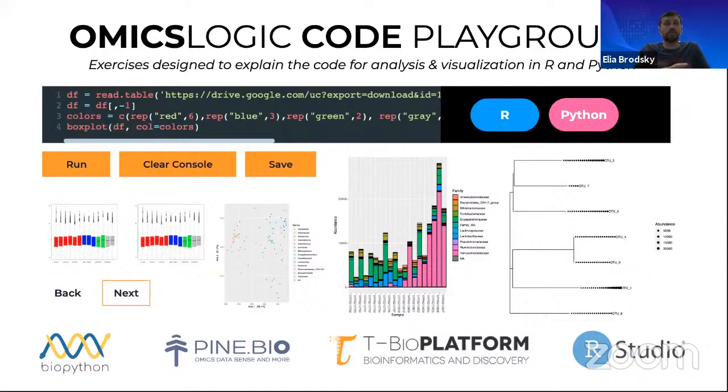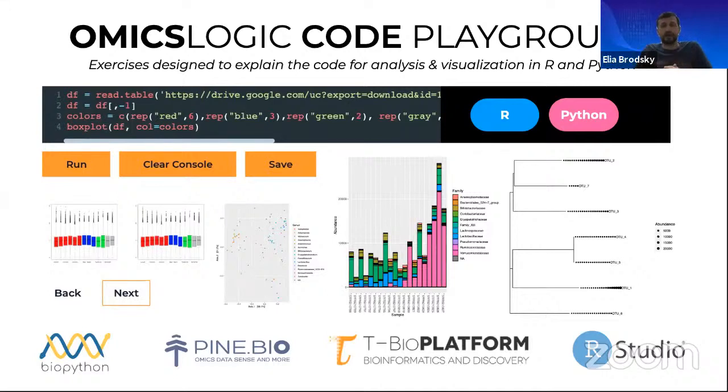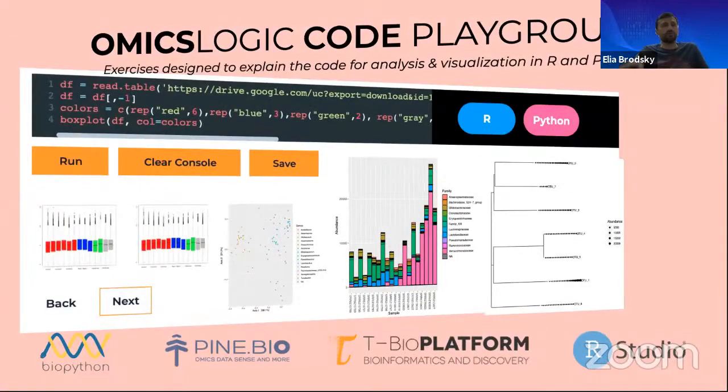One of the things that we will use in this session is several practical coding exercises to help us load data in R and Python, explore this data using visualization tools, and map this data onto different types of categorical values from our sample design. We will look at different types of applications when we have data that is already processed or data that is raw, and how to deal with that. Some of that coding experience is something that you can already go ahead and try on learn.omicslogic.com.